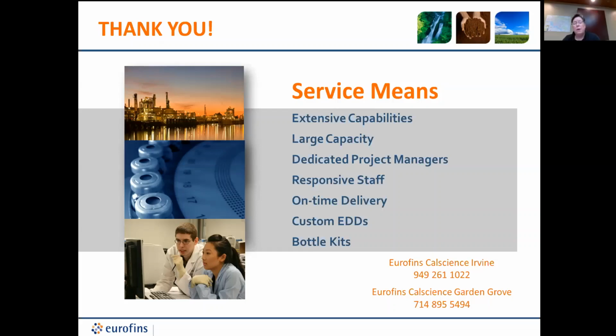And for VOAs, the minute you open a VOA, you've just biased your sample low potentially. And then by combining them, it just creates some uncertainty with the data, I would say, when you're asked to combine methods or composite methods that shouldn't be. Some labs might take a volumetric syringe and pierce through the top of the septa of a VOA and pull out 1 to 5 mLs and transfer that into another closed septa and try to do a flow composite that way, you know, volume composite. But you're still at some point having headspace touch that sample, and things can volatilize into headspace. Right, that's the whole point of VOA, is just to try to avoid the headspace.